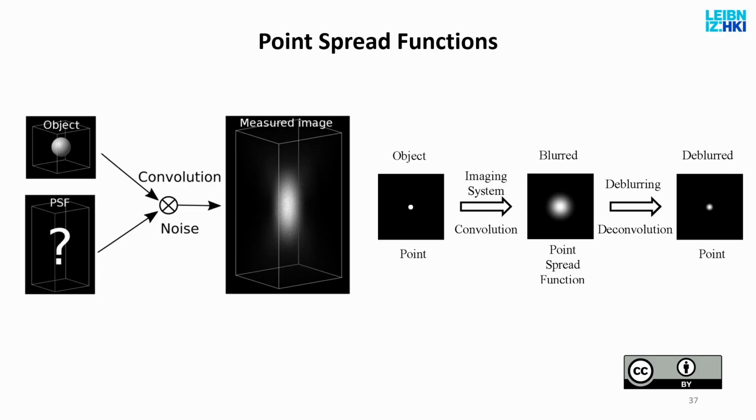And it does exactly as the name says. It tells you that if you put a point, a perfectly spherical object, under the microscope, with a size below the resolution, what will the image look like? How does it spread the image of a point into a real image?